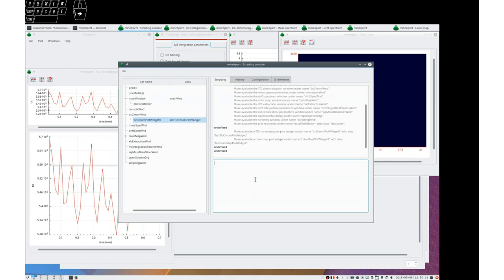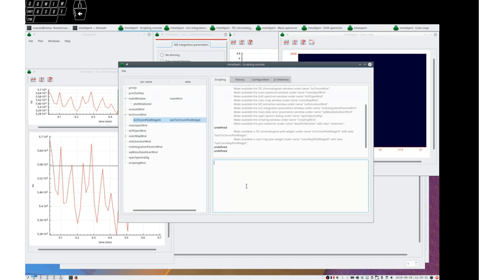And now I have that variable. I may want, for example, to integrate that file to that data to a mass spectrum.